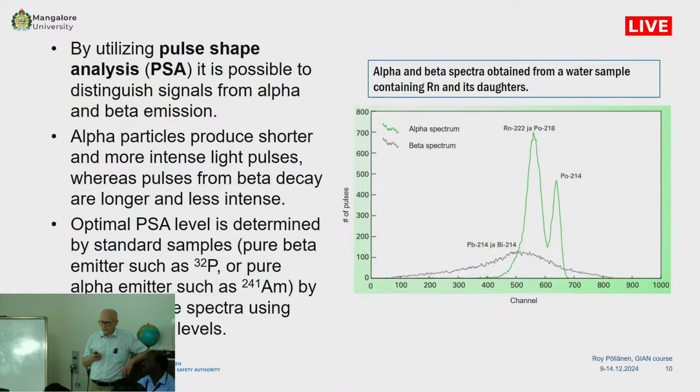I think we have 3 or 4 of these Quantulus systems in my laboratory, as you saw in the video. We are routinely analyzing polonium, for example. So I had a question. If you are analyzing alpha using liquid scintillation counters, wouldn't there be a problem of attenuation due to the vials? Because alphas are not that penetrative enough.